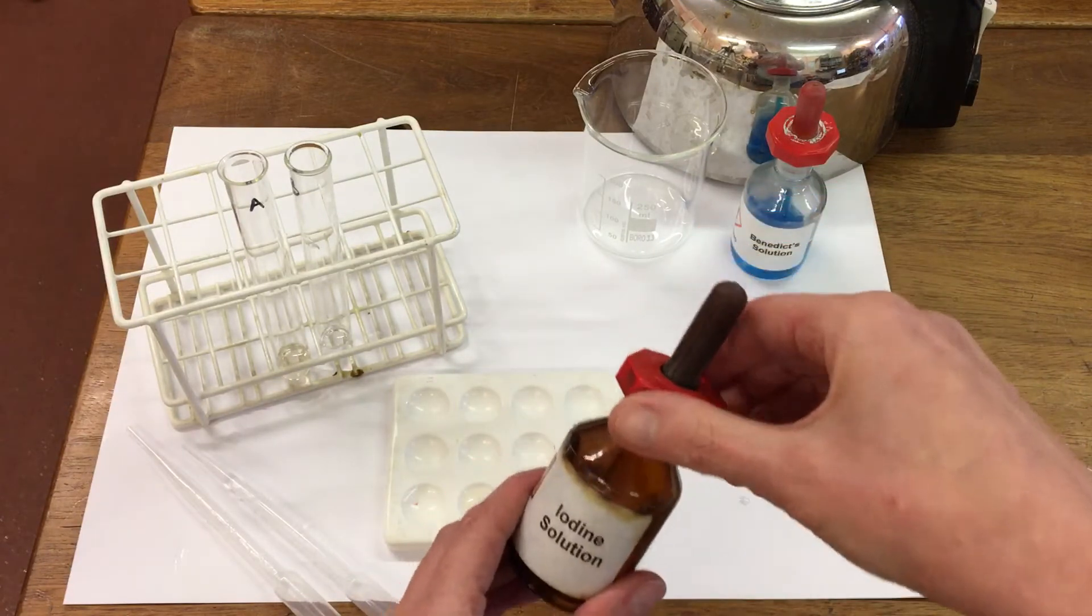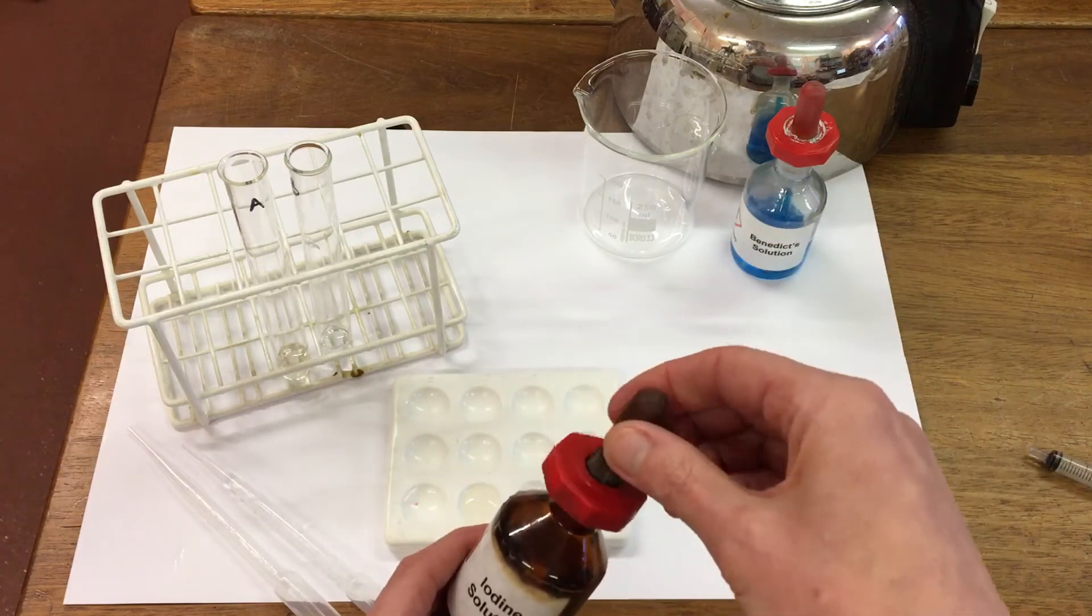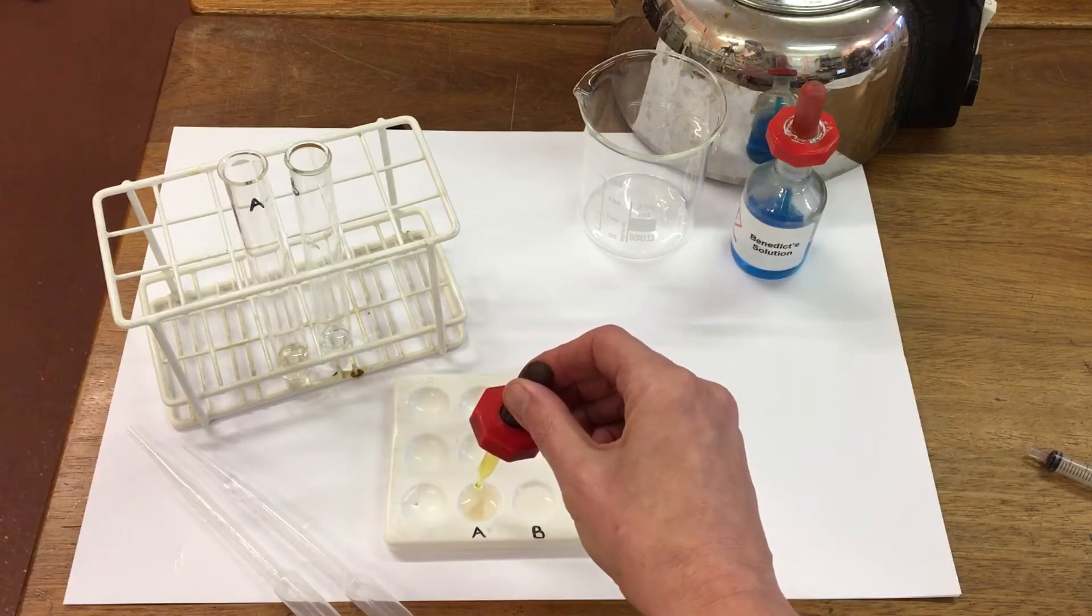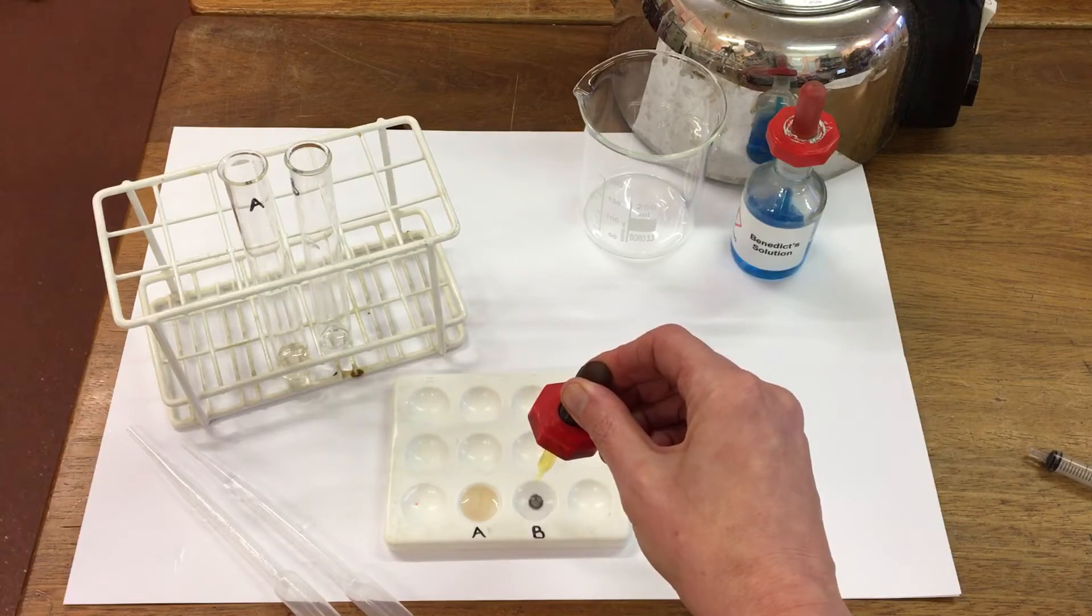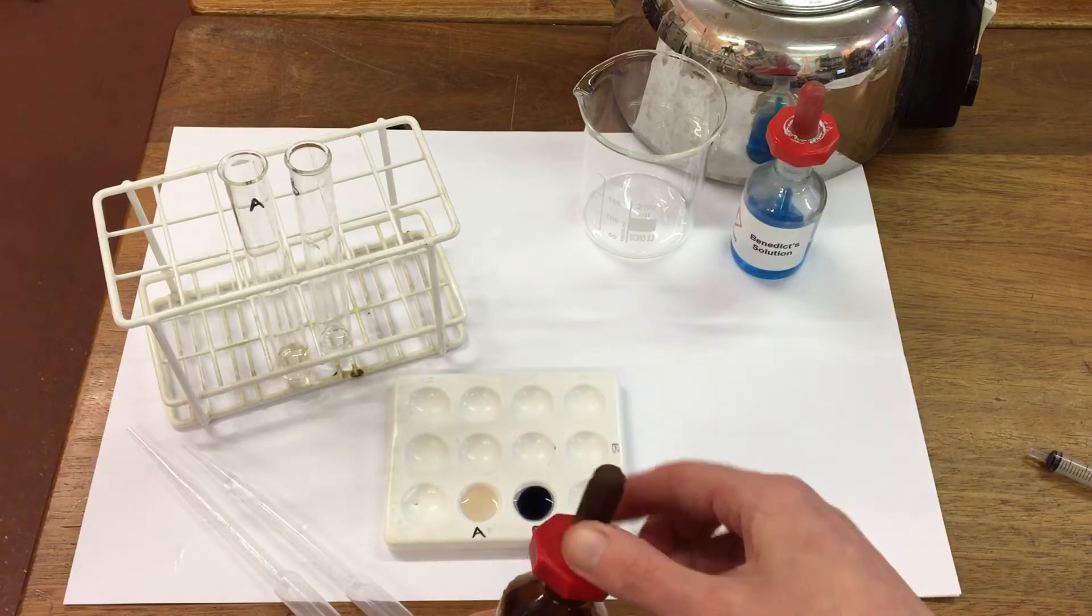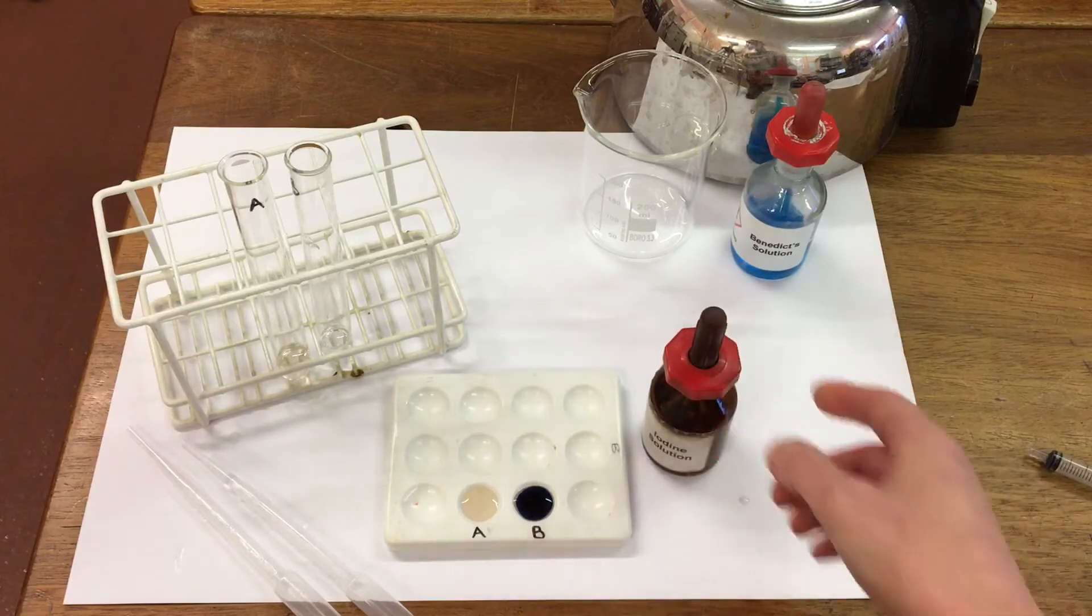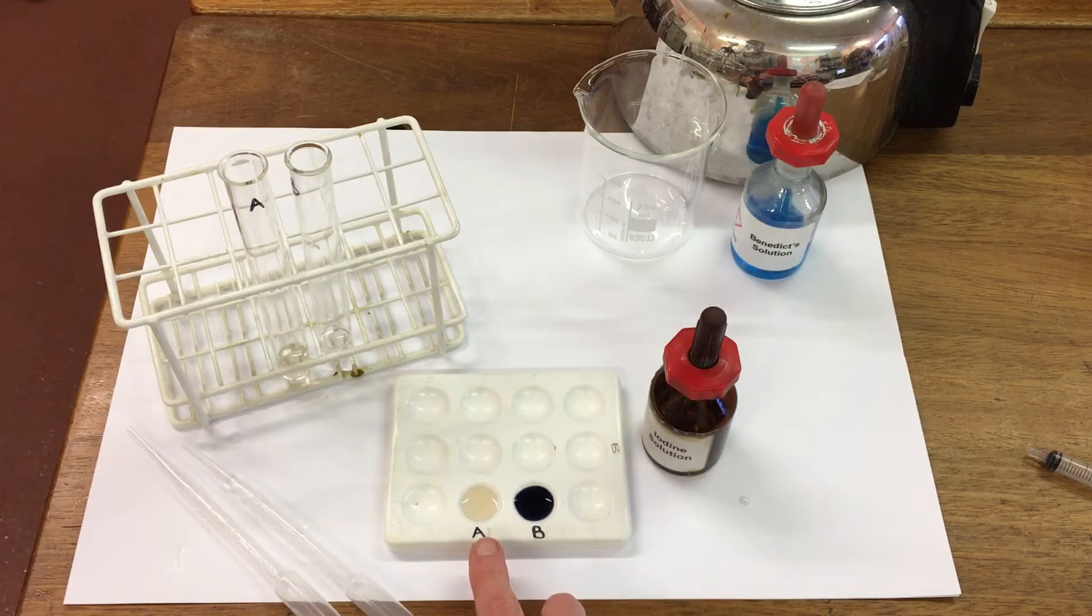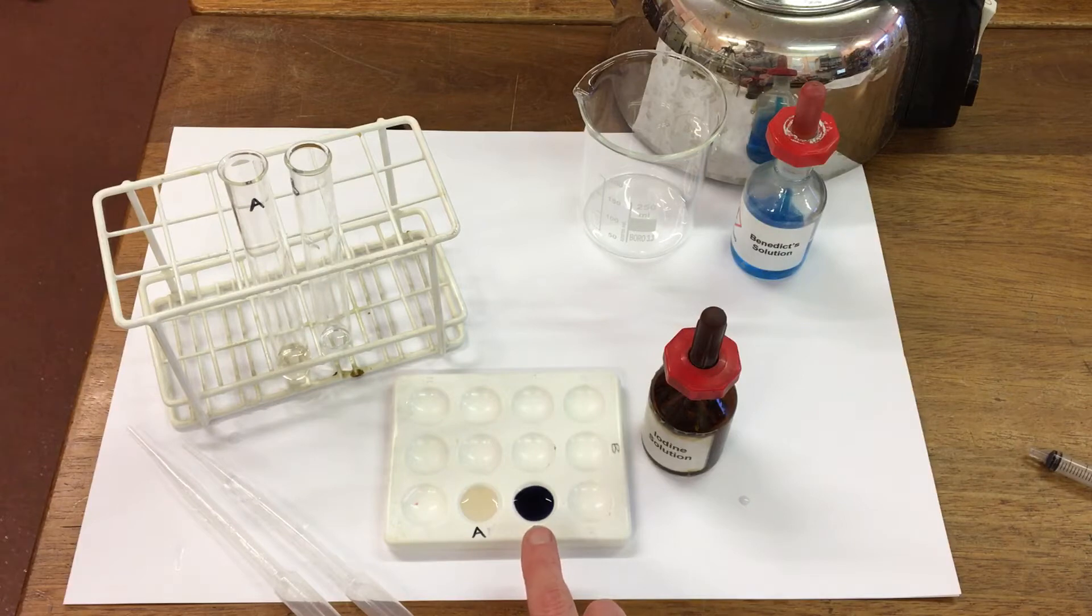Using the iodine, we can see for A there's no color change, so all the starch is gone. And in B, the iodine has gone blue-black color. So this is a positive test for starch.